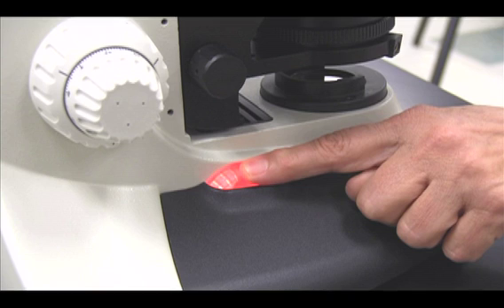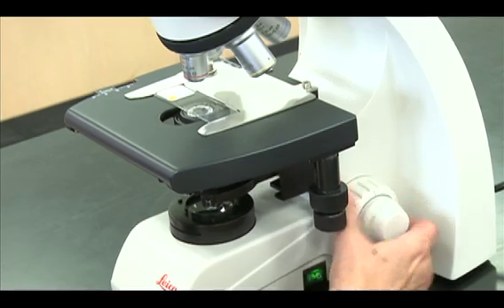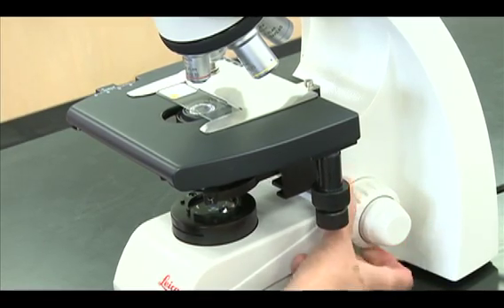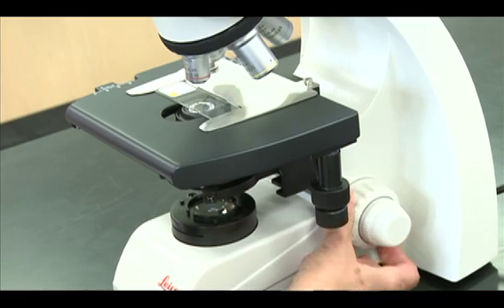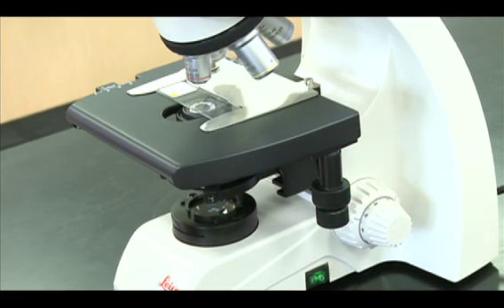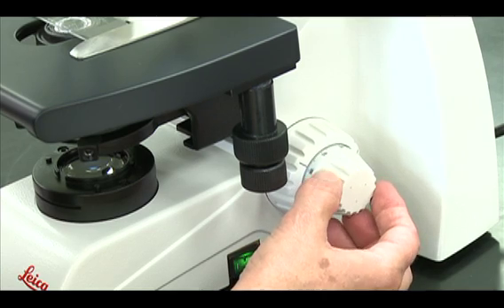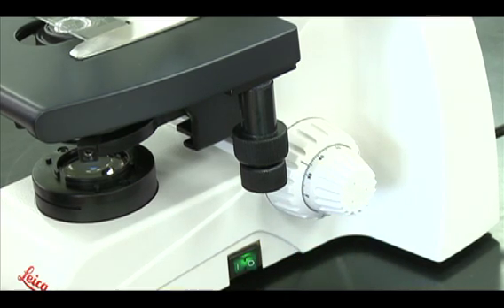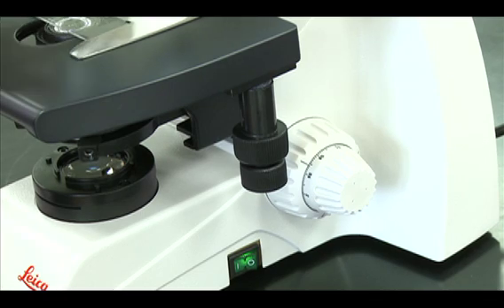Use the rheostat to increase the light to a comfortable viewing level. Use the coarse adjustment knob to raise the stage all the way up. Use the fine adjustment knob to lower the stage until the slide is in focus.